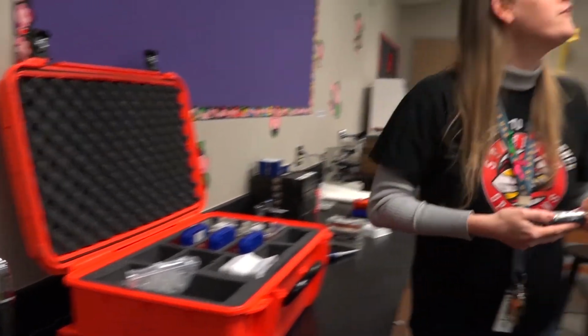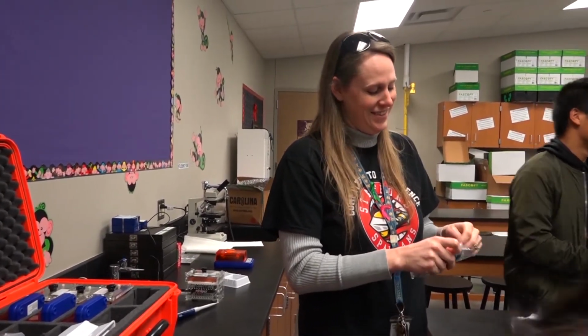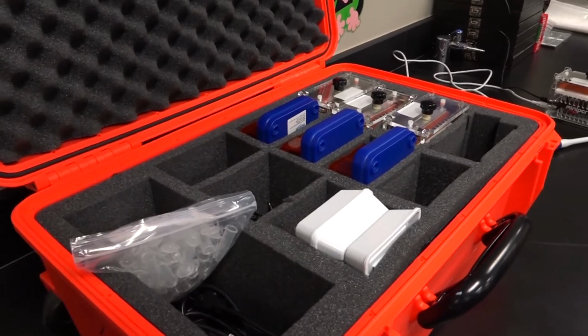At a professional development training, Merck and other teachers heard about the chance to get loaner PCR machines in their classroom. And so we're all, at the AP training, we're all signing up for the mailing list right there. Get your phone or your computer out and sign up right then. Because everybody was excited about this possibility that maybe we could actually do PCR with our kids, because otherwise that's not a reality for us.